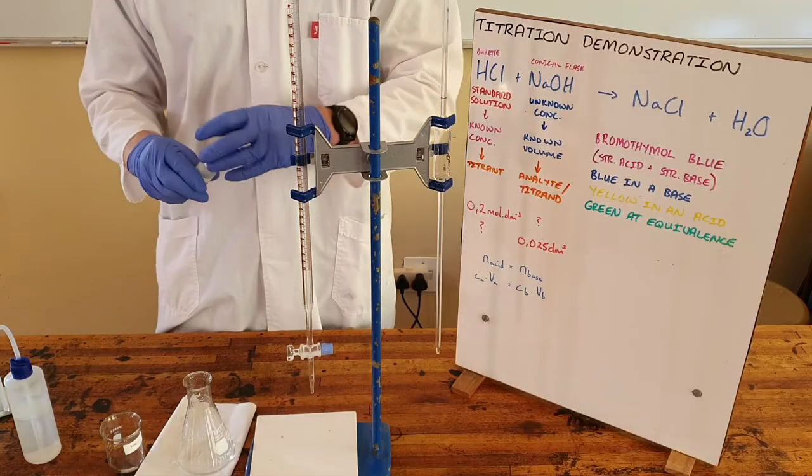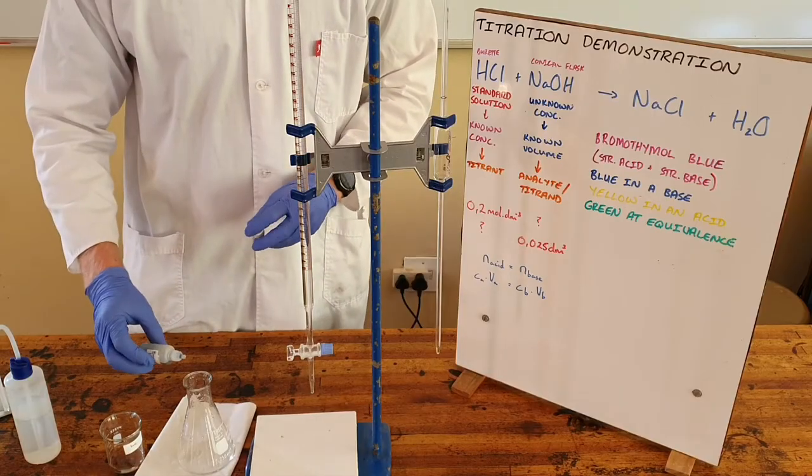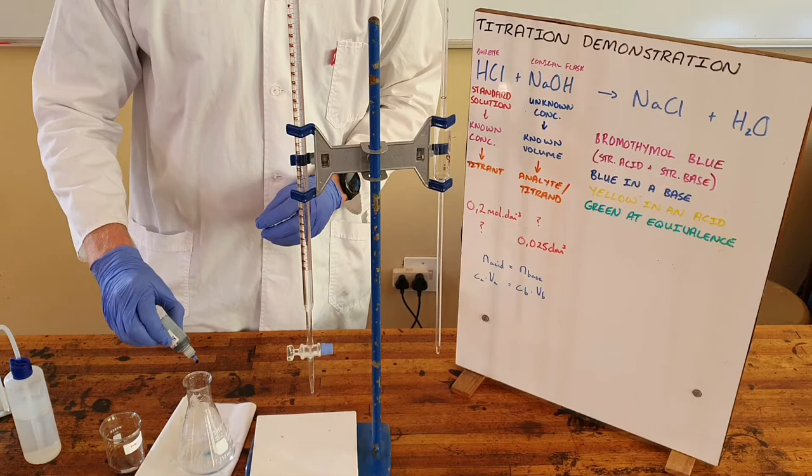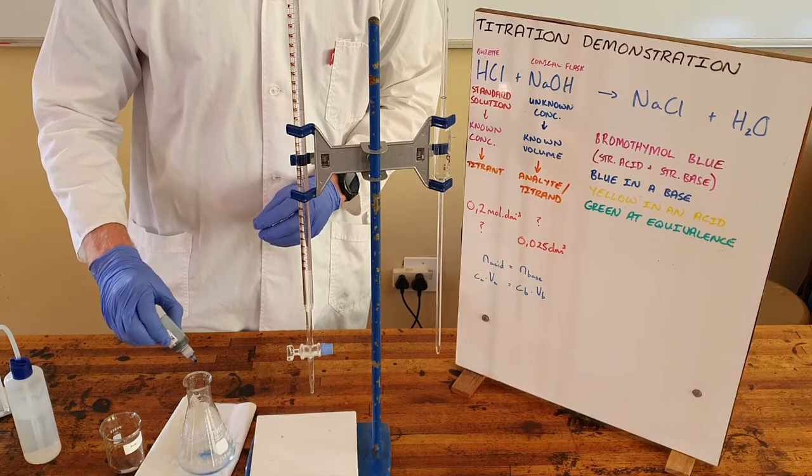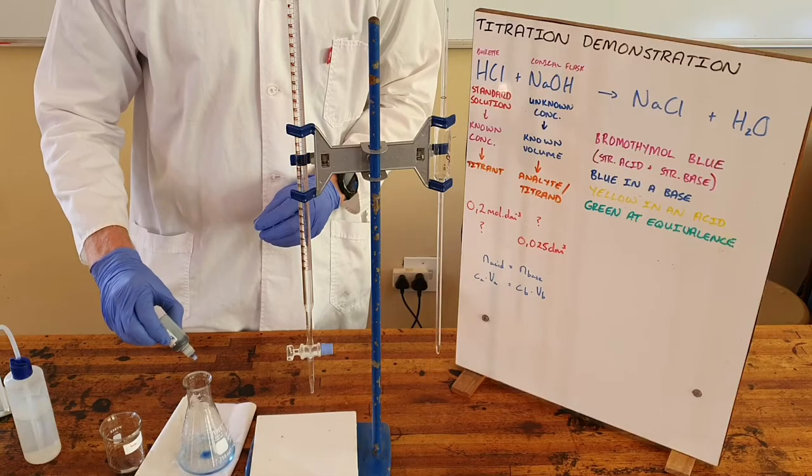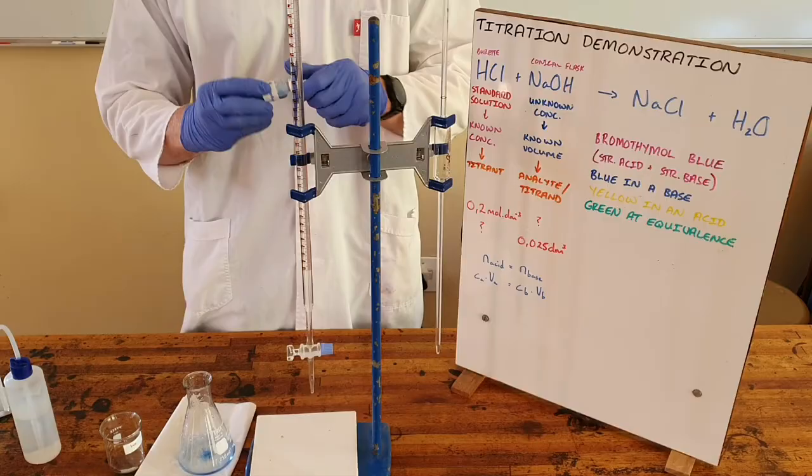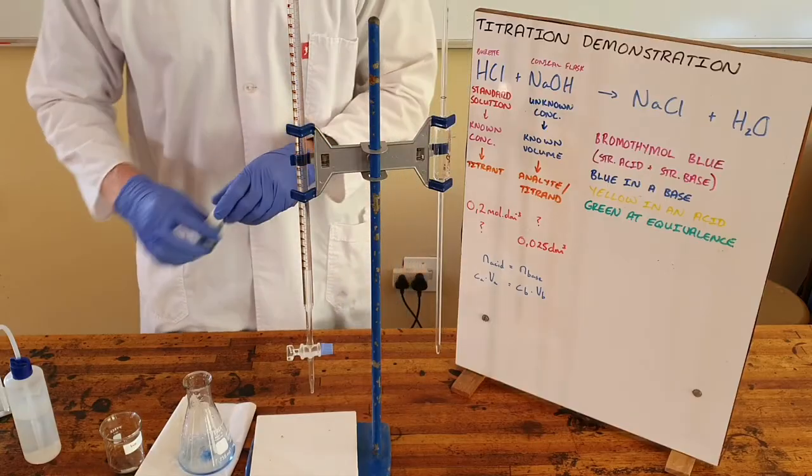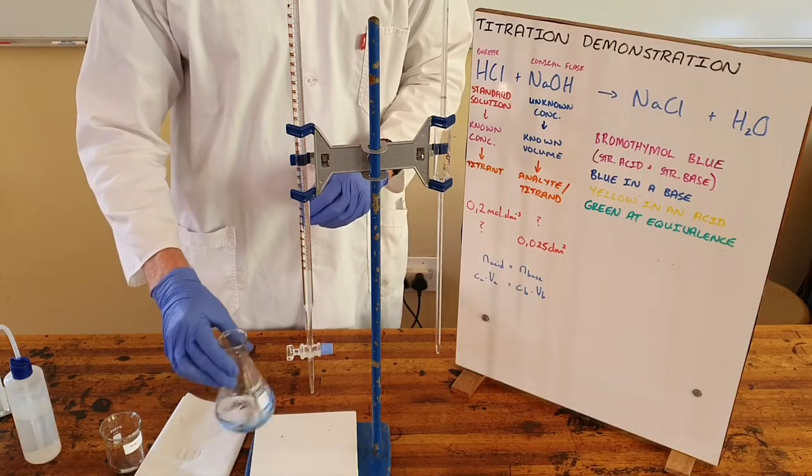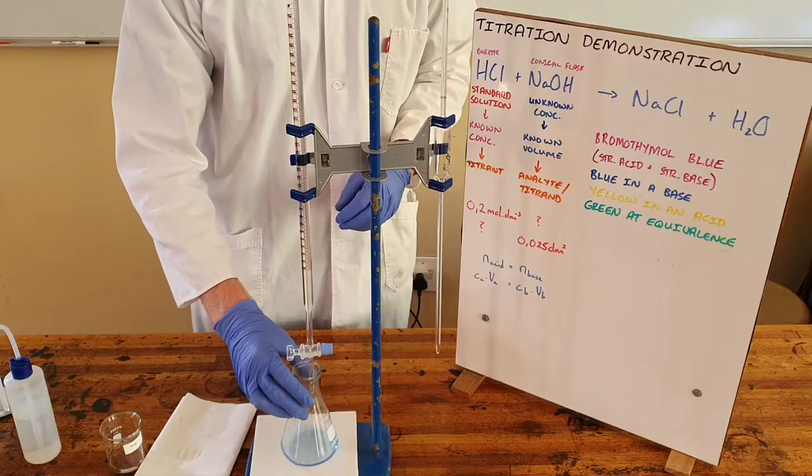So since this is a strong acid and a strong base we can use bromothymol blue which we know is blue in a base and yellow in an acid but what interests us is the equivalence point here which is the point where the quantity of acid has completely neutralized the quantity of base and we know that happens when this is a green color.